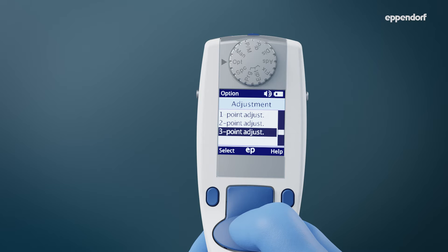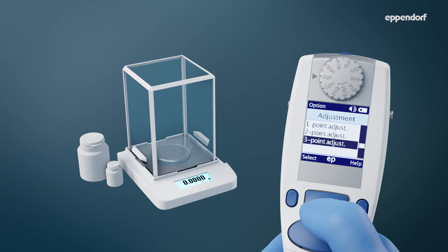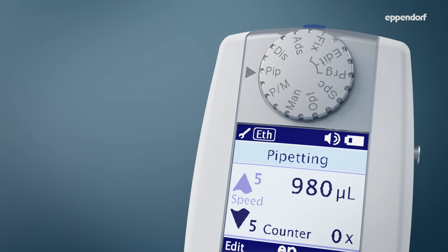Custom adjustments should only be performed with care and require an analytical balance for gravimetric tests. The wrench symbol indicates changes to the factory adjustment in all operating modes.